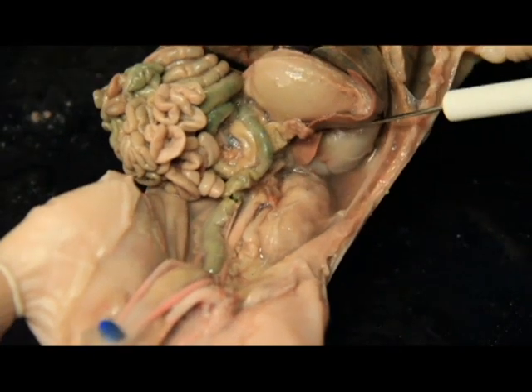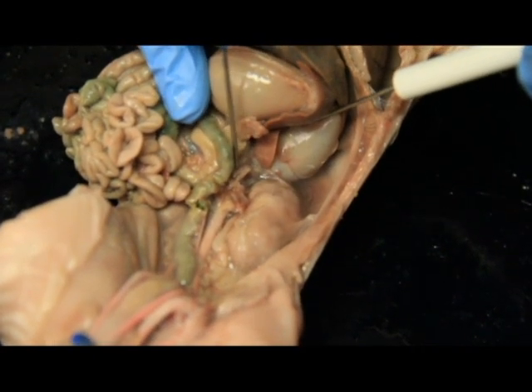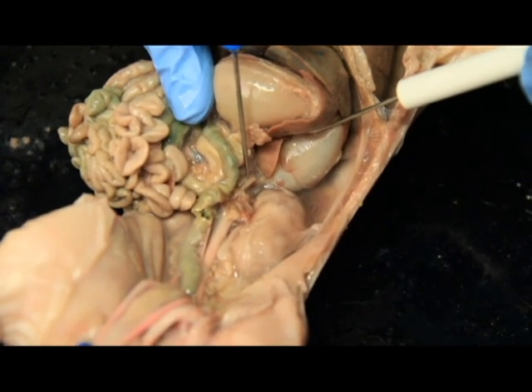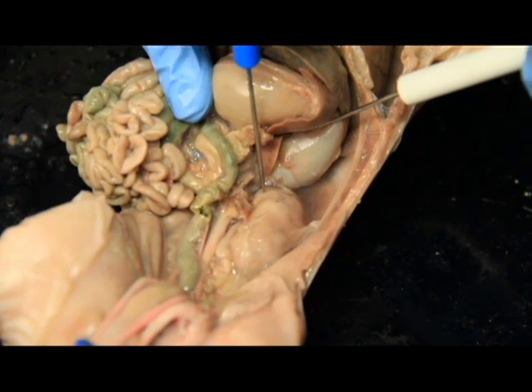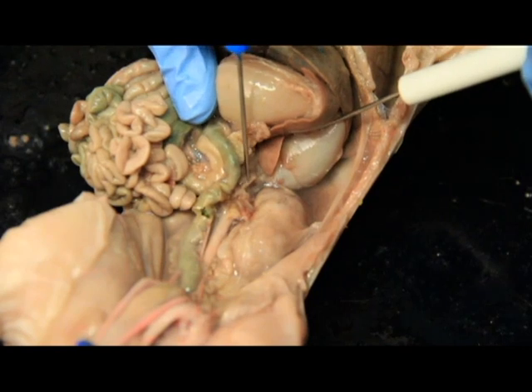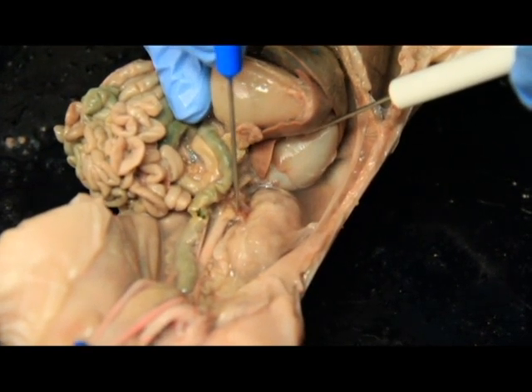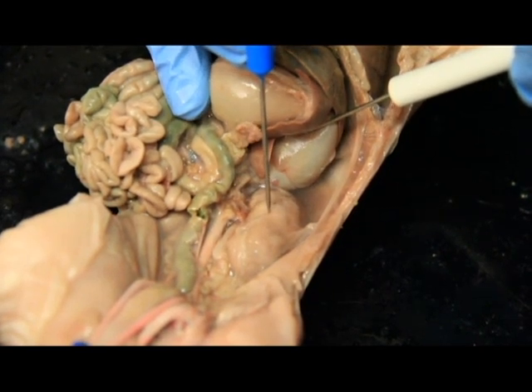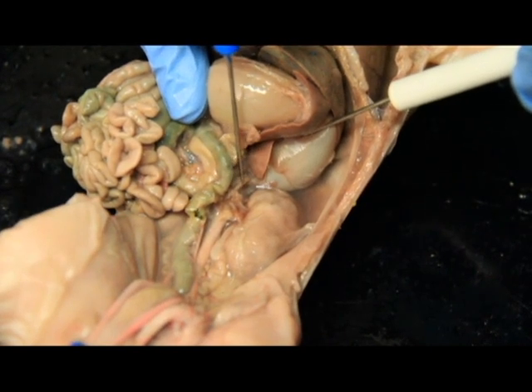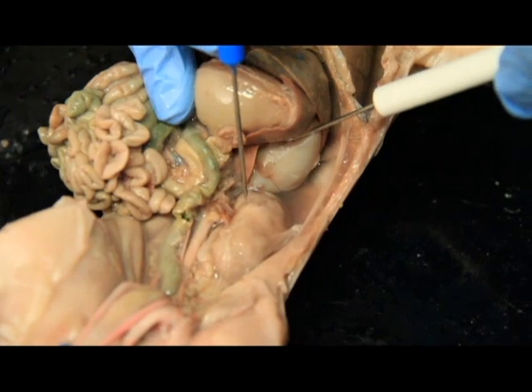Now what's going to be really hard to see is this tiny little guy right here. This is the little gland that normally, because I'm pulling it back, is far away from the kidney, but normally this would be sitting right here, on the top and the inside of the kidney. This tiny little flap right here, that's the adrenal gland. So remember, these are the renal arteries and veins, because renal means kidney. So adrenal, meaning on top of the kidney, adrenal gland right here, which is going to be sitting on top of that kidney.